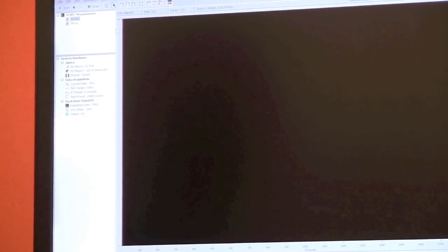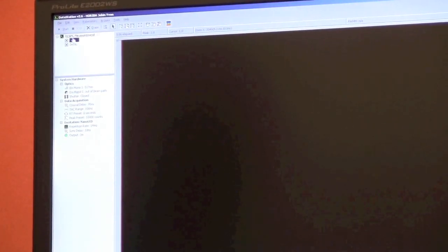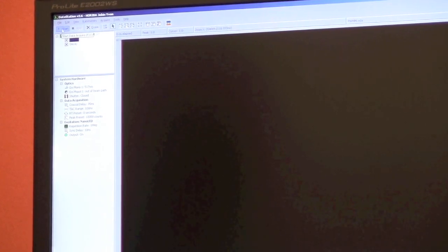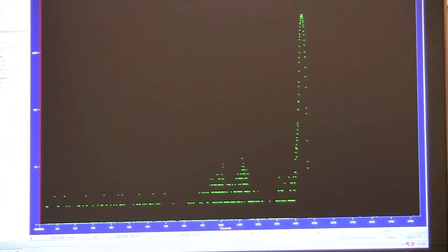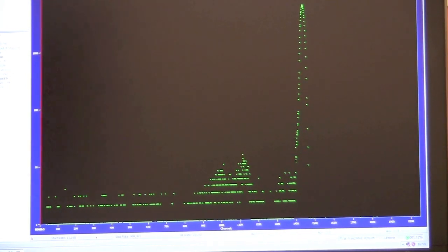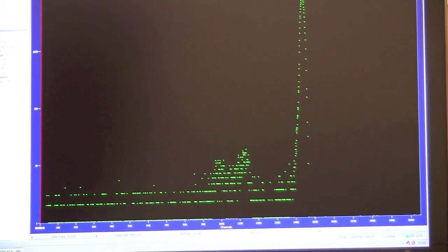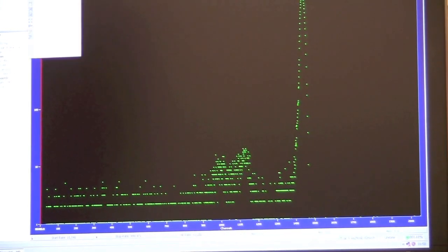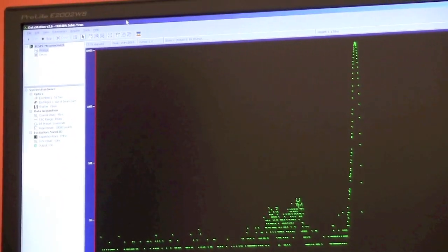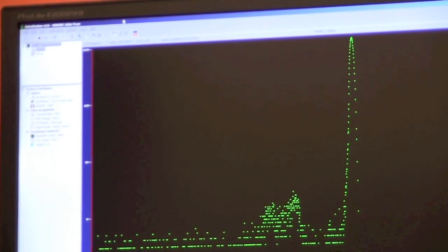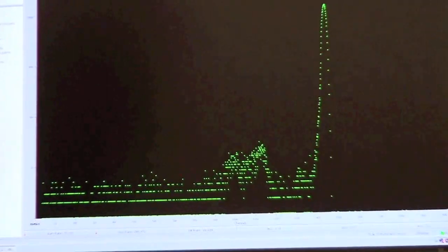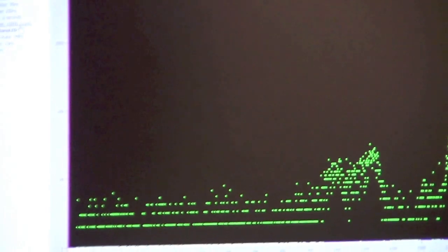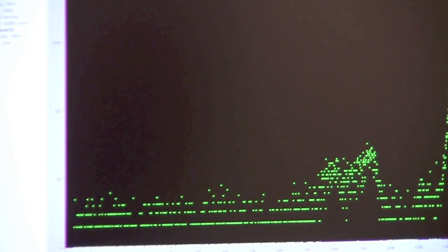Now that we're collecting the maximum amount of photons, we're going to click on Prompt and Start. The instrument will start counting photons. One thing you might like to do is view the data going from left to right, which I can switch after it's done recording. We've already set the peak to 10,000 counts for the highest bin, so once it hits that, it stops.